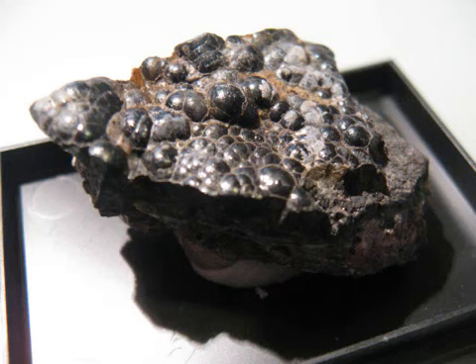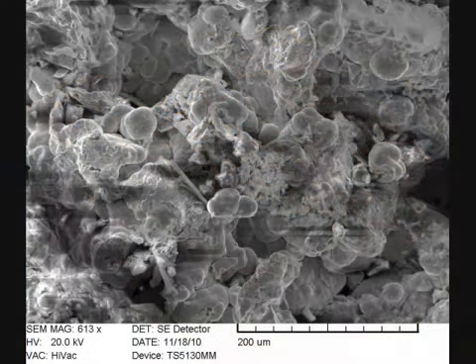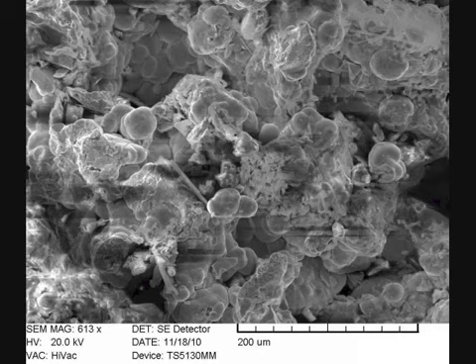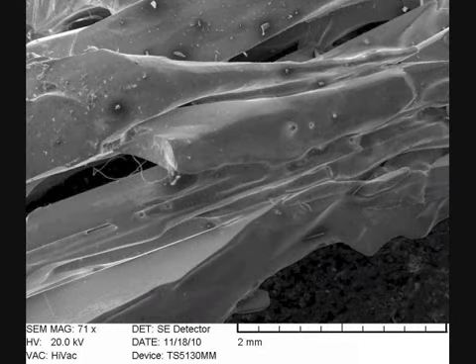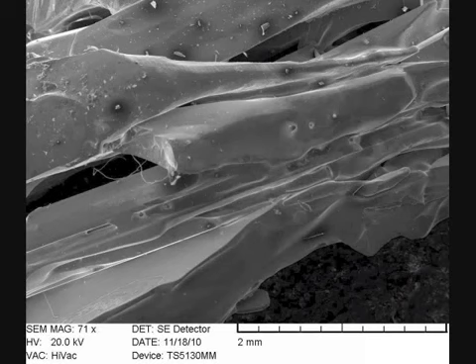And what is kind of funny is that you can actually see this under the electron microscope as well, even though you could not see it from the outside in that sample. So here you can see the uranium ore under the electron microscope. You can see the magnification is not all that high, but it's still quite a nice view on that mineral sample. I didn't know it would show those little bubbly appearance even in microscopic view. And now for something completely different. Silicon carbide, which is really smooth and has a little hair on the left, as you can see.